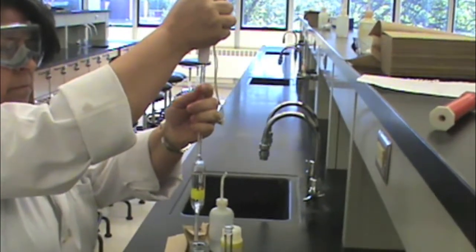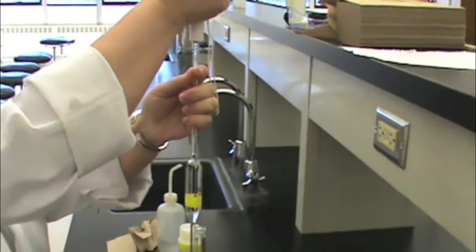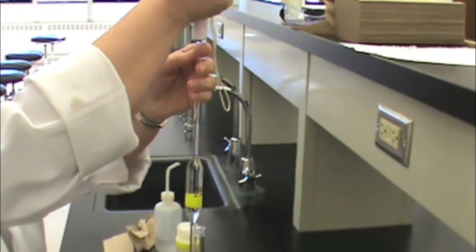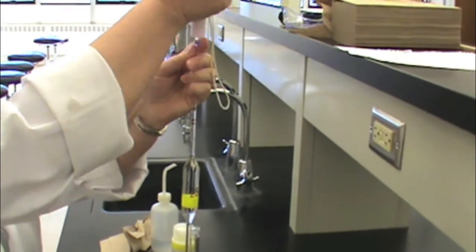You will want to make sure, again, that the liquid is above the line marking on the volumetric pipette before you remove the bulb and place your index finger over the top of the pipette.